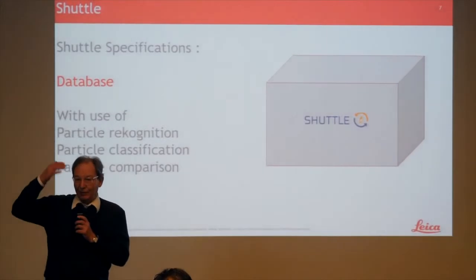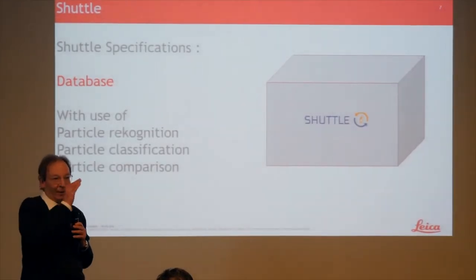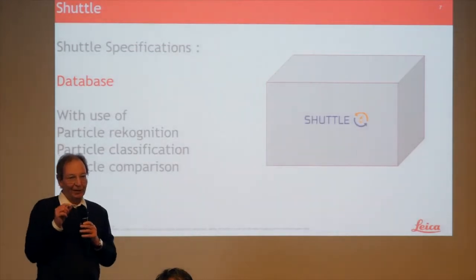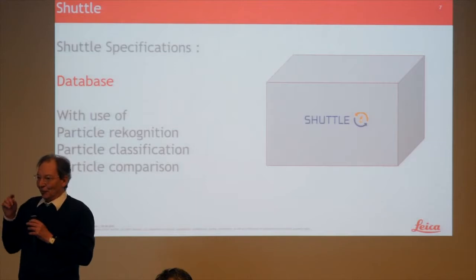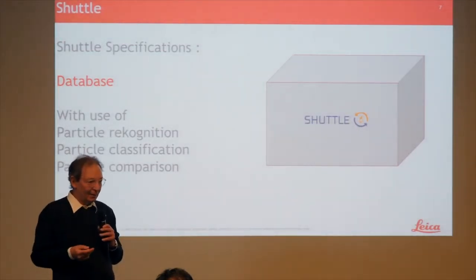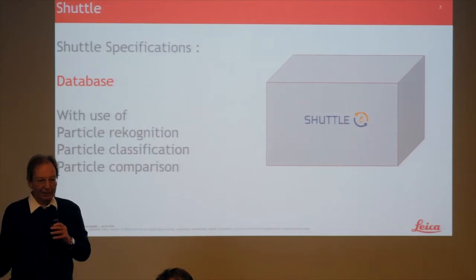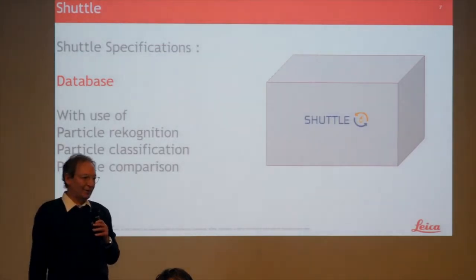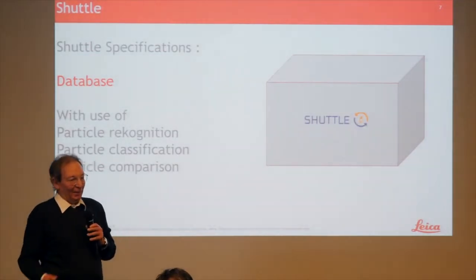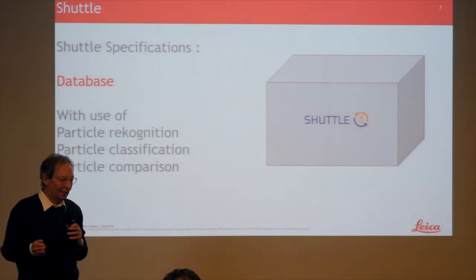And the database, just having talked about potential dimensions of the image files, with the potential to actually catalog the particles individually, if I understood that right from yesterday, and to then compare this to particles from another scan would require a real huge database. But really, really huge, because our images that we put in and the number of particles goes up extremely fast. I don't know how many particles you expect on an A4. Somebody might help me with that. But just cataloging one single scan then will require enormous computing capacities as well.